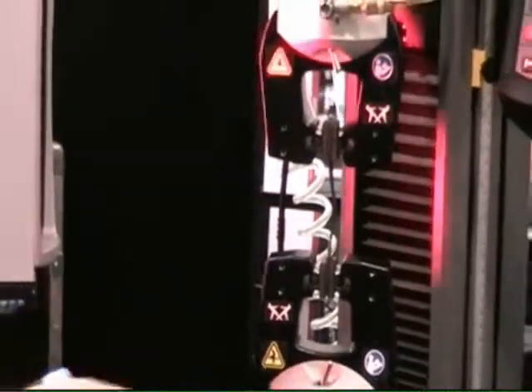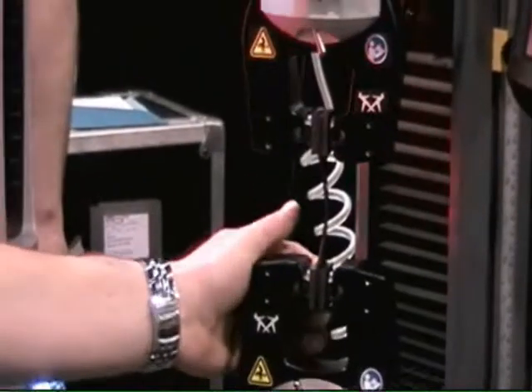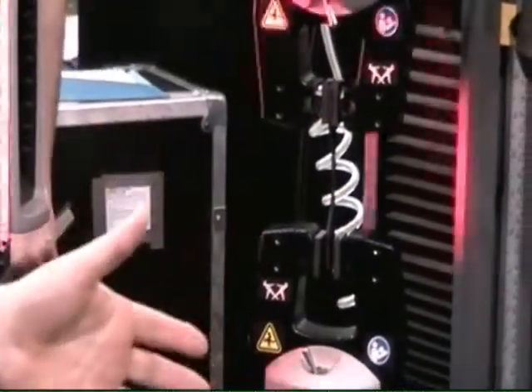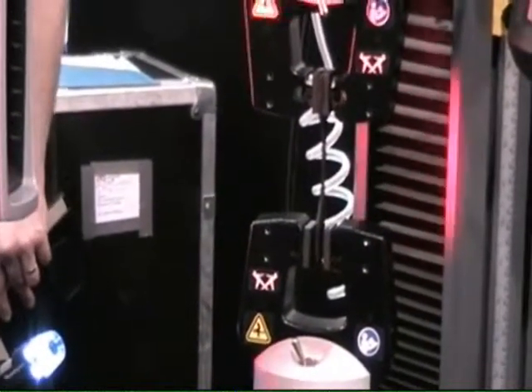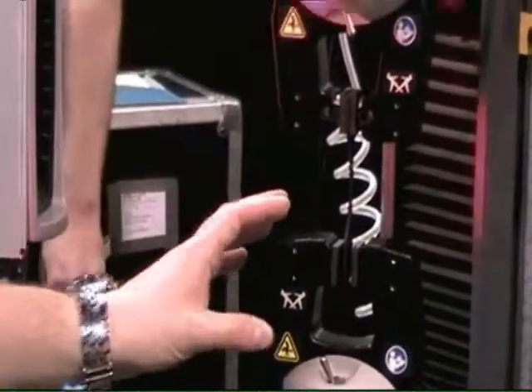So you can fit thicker specimens in. There's more area in the throat to actually get your hands in there to load your specimen. Another important feature is that while there's more ability to get the bigger specimens in there, there's more risk of potentially getting your fingers pinched. So we've added a lot of protective features.